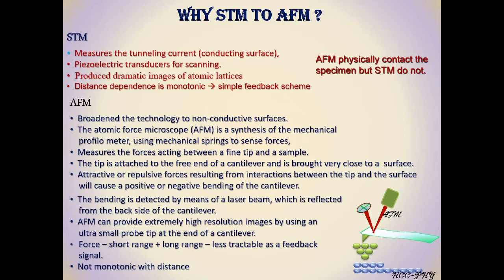The AFM works on a principle similar to a record player, and the tip is made of silicon and silicon nitride, whereas diamond is used in the record player. But the atomic force microscope is a new and relatively cheap method of imaging objects from nano to micron scale.